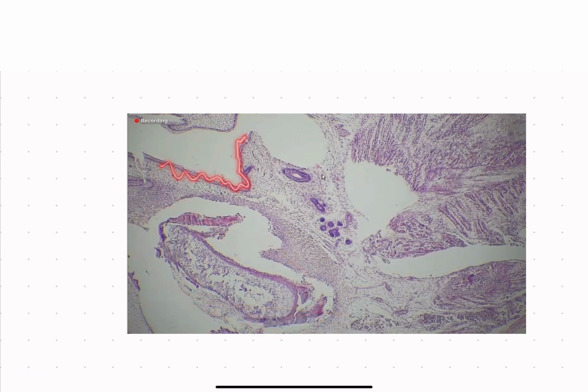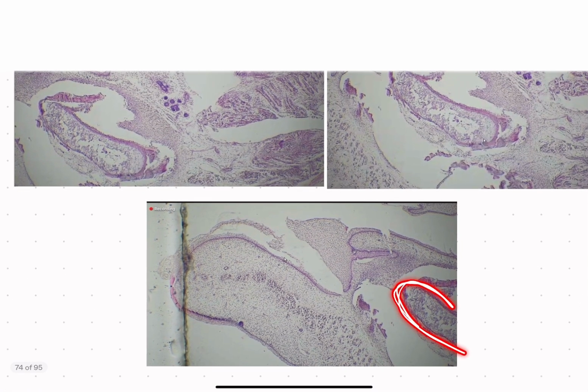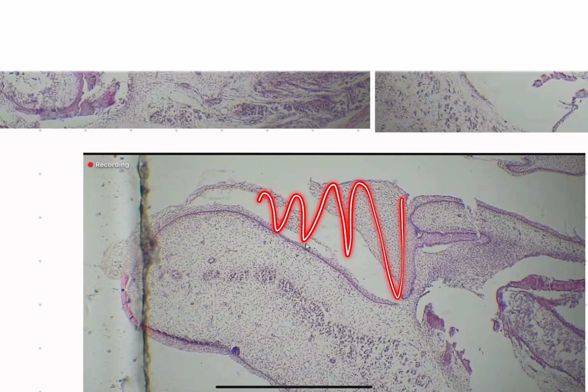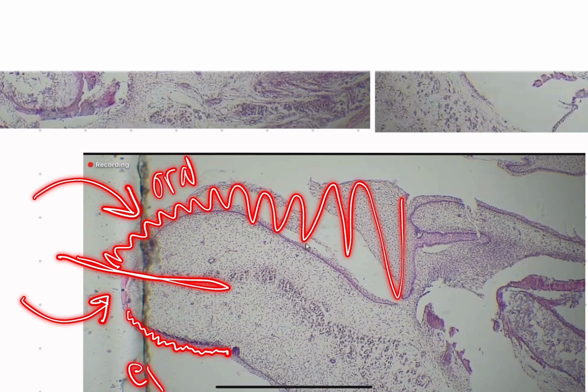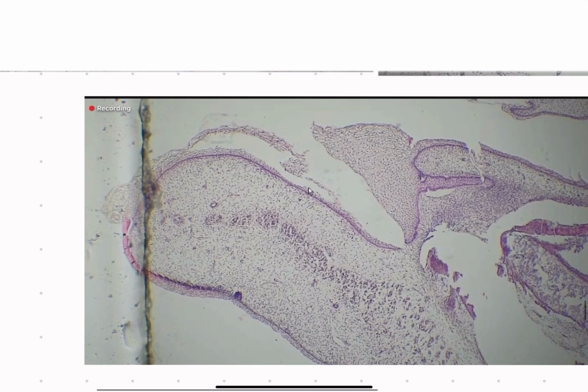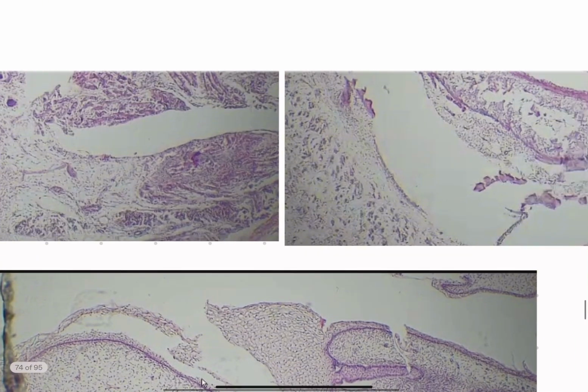We have the oral epithelium here, which covers the inside of the mouth. And then further on, this is where the Meckel's cartilage ends. We can see the lower lip. Now again, all of this right here is the oral epithelium. And then this is the epidermis, developing epidermis. So this is kind of the line of the dry skin side of the lip and the mucus inside of the lip. So oral epithelium here and then epidermis here. Very important distinction.